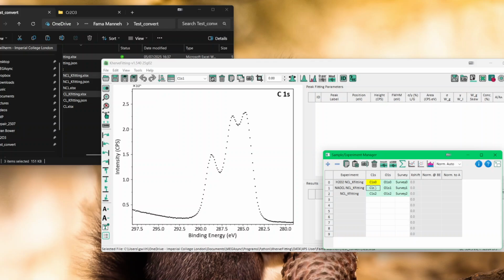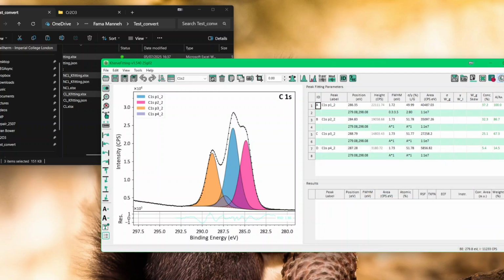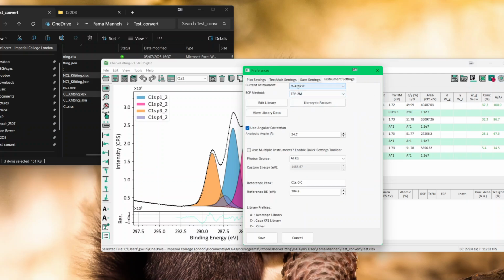So we'll need to find it though. But this is, yeah, that's it. This is this one. So it can preserve the peak fitting if you've done already the peak fitting in one of those. Okay, so this is a nice little feature. I've also added the RSF, and this will be later on using the NPL transmission, but I've not done it yet.